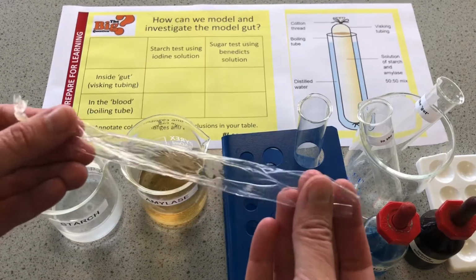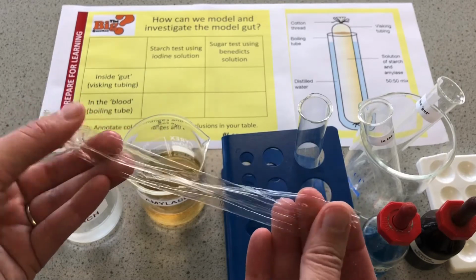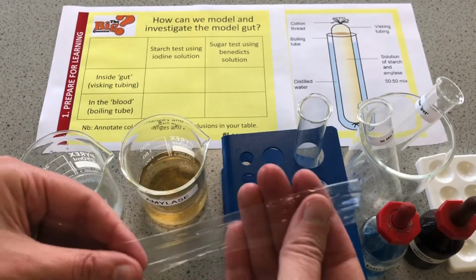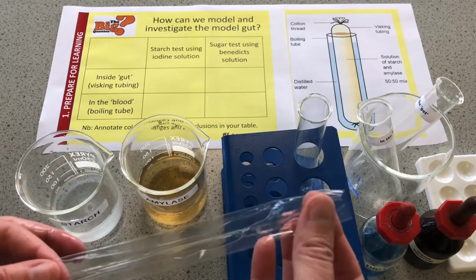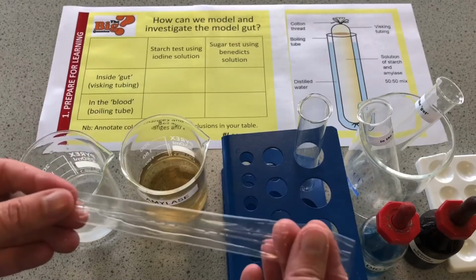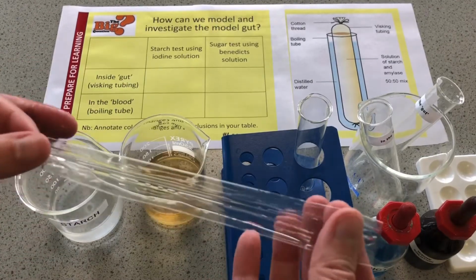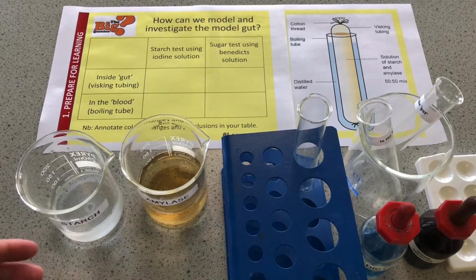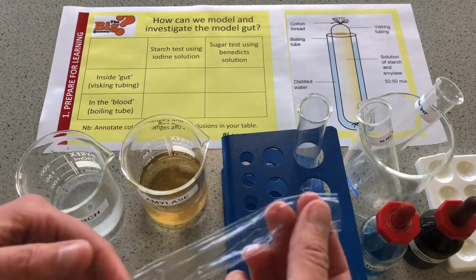So this is called Visking tubing, and we're going to use it to model the small intestine. It is a partially permeable membrane. That means it's partly permeable. Some stuff will go through it, the small soluble stuff like glucose. Some stuff won't go through it, for example, the starch. That's why it's so important that we digest our food, make it smaller to enable it to get through.